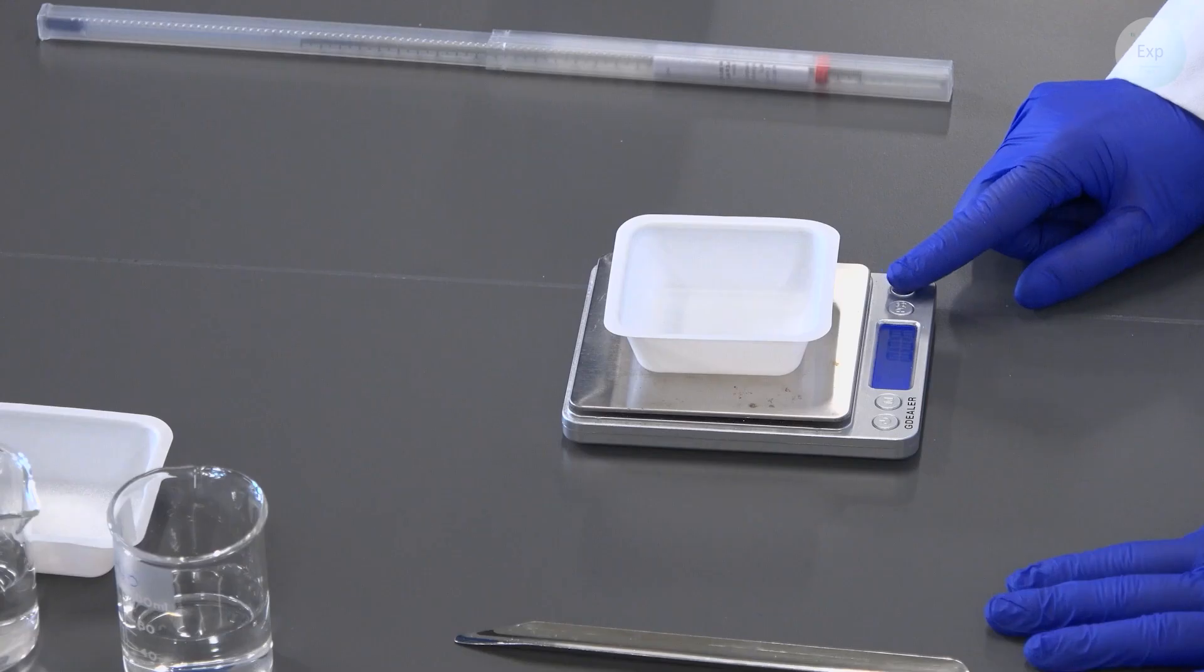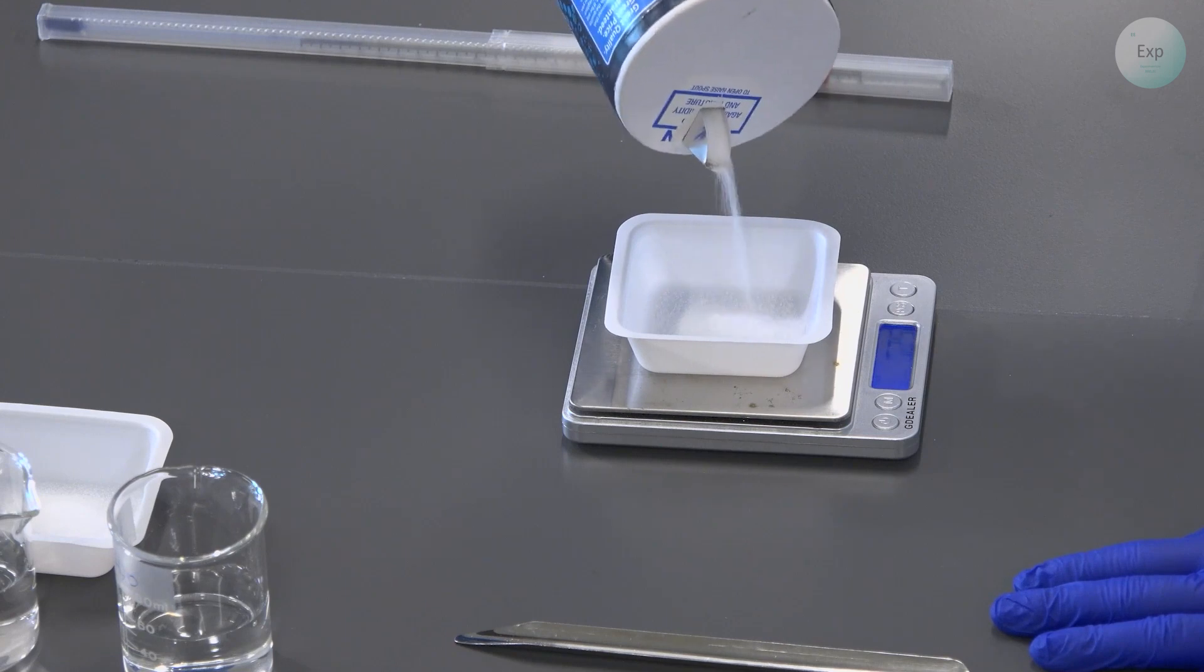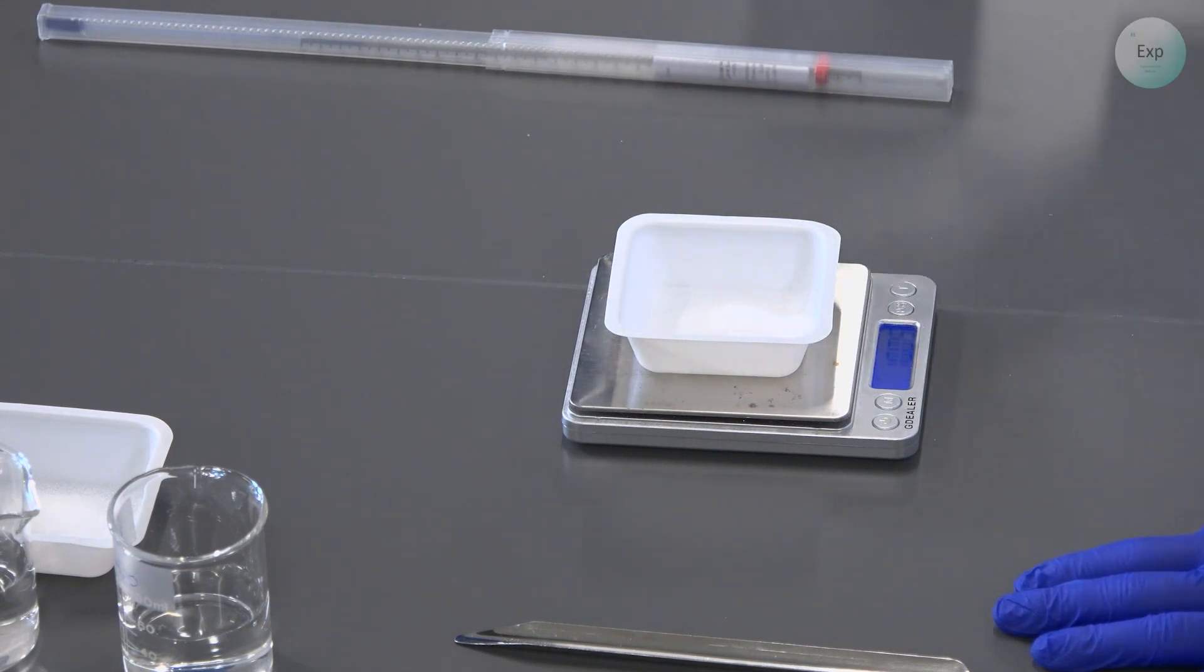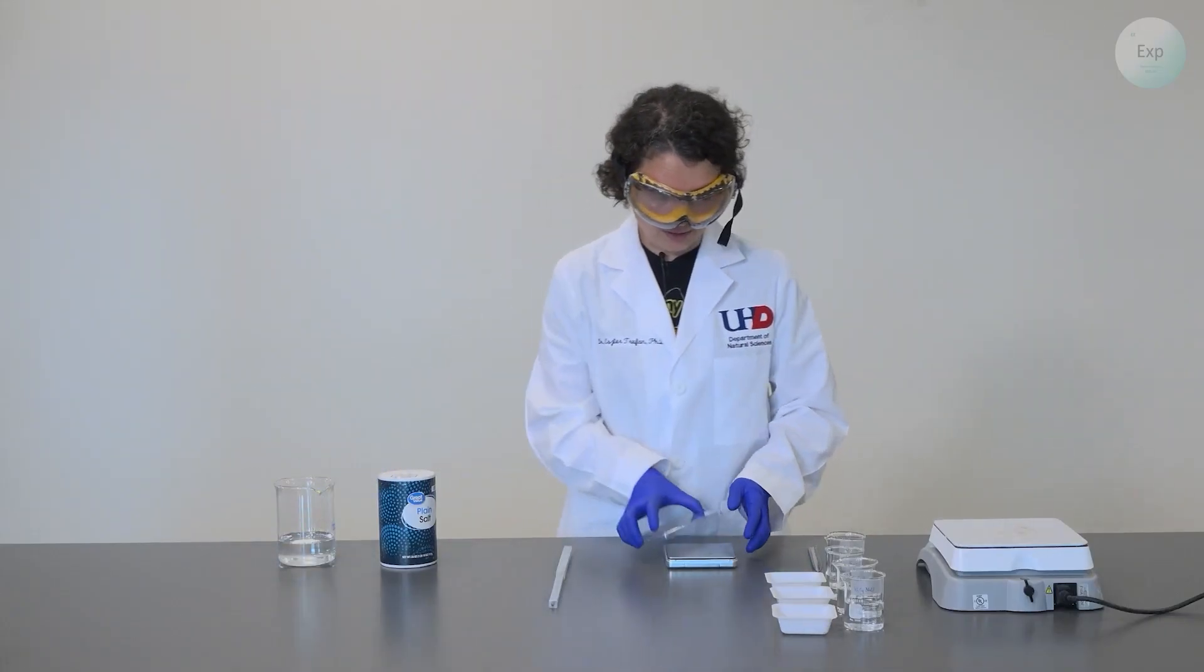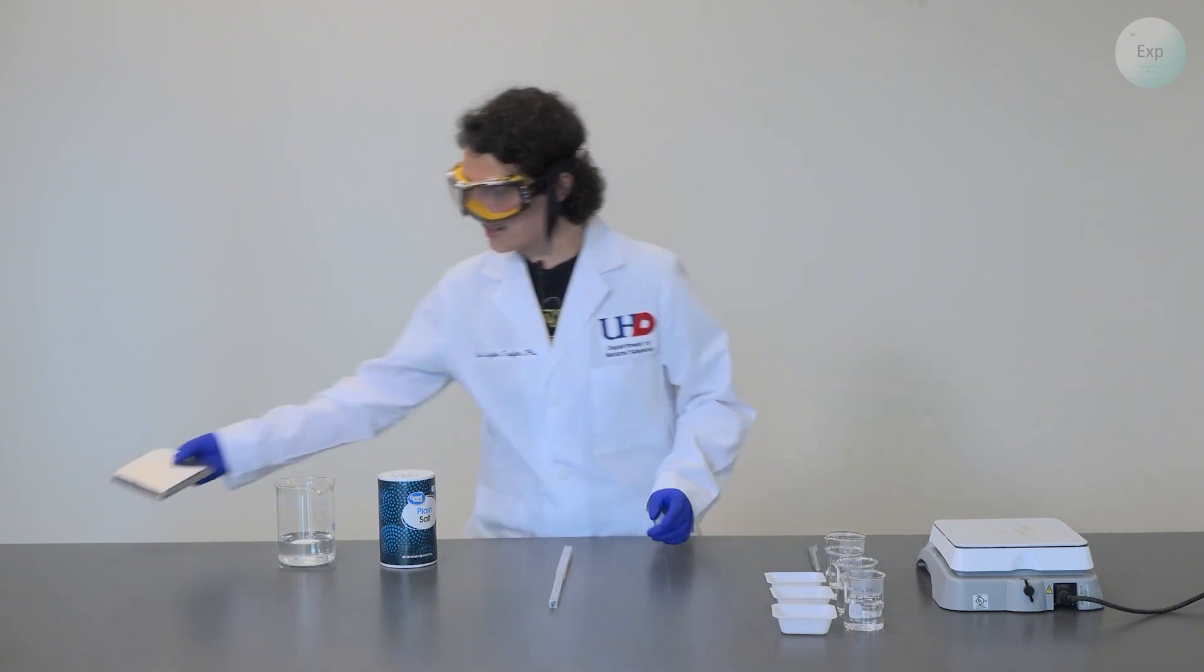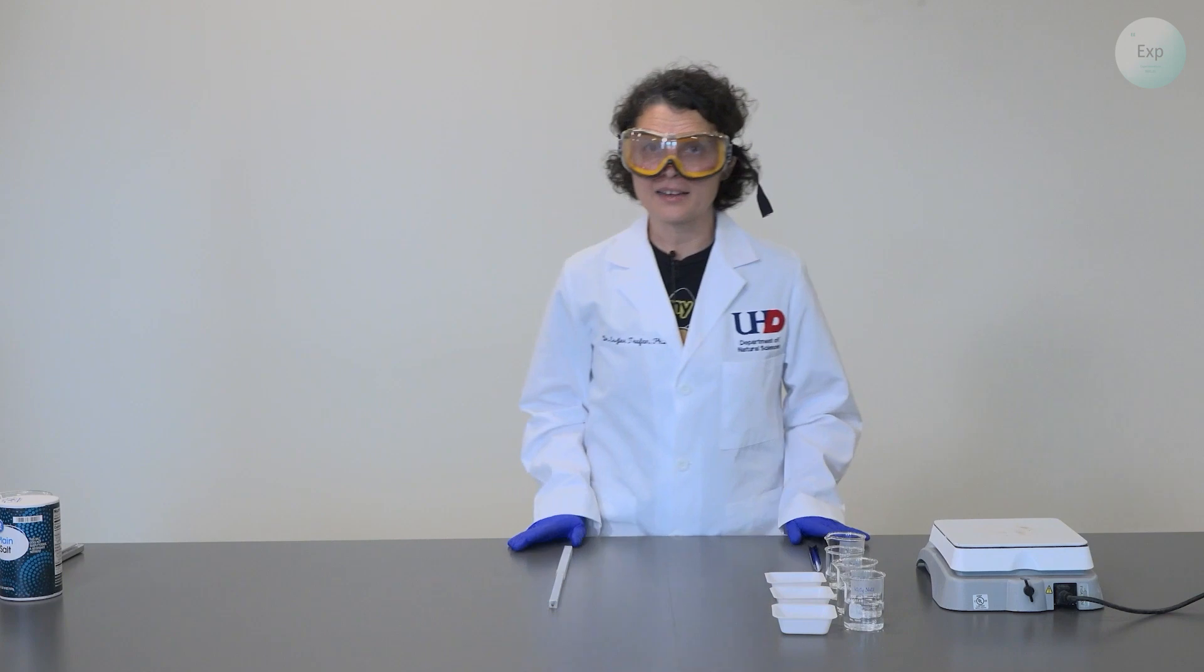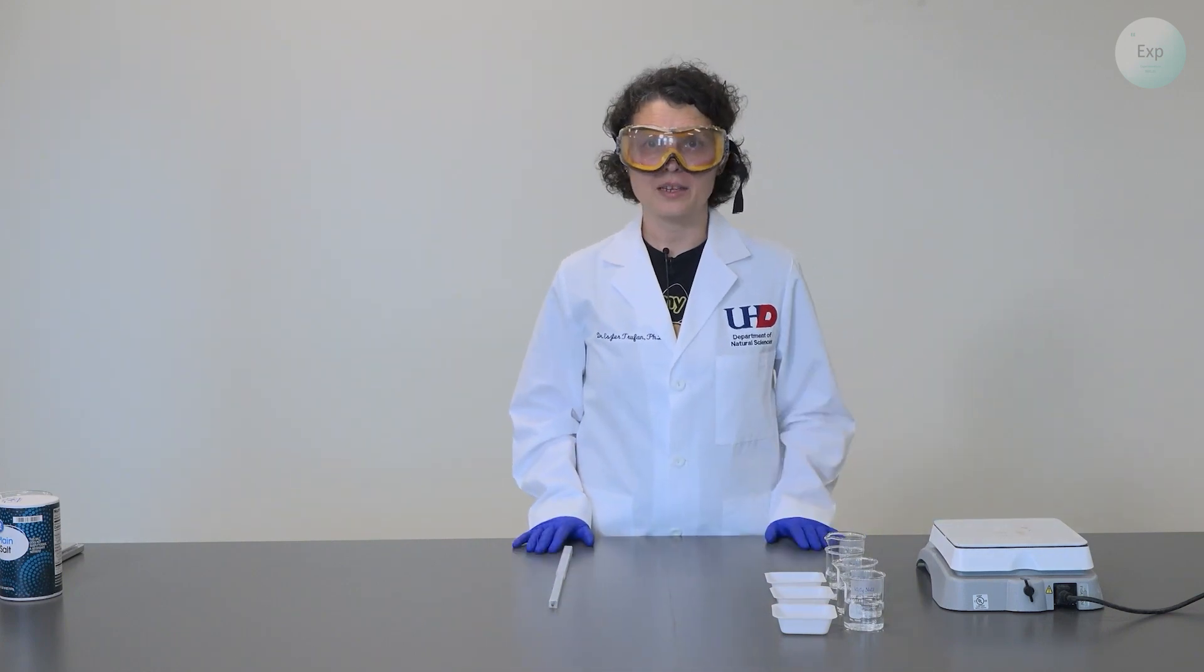And then in my final weighing boat, I will measure out 10 grams of sodium chloride. I measured 10.04 grams. With that, all my mass measurements are complete. I will set my scale to the side. All my chemicals have been selected and measured, so those can go to the side. I can move on to making my solutions.